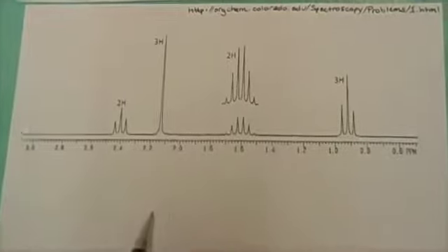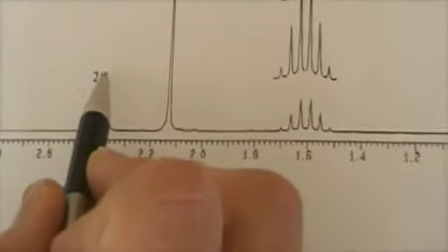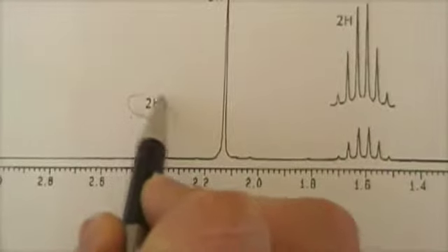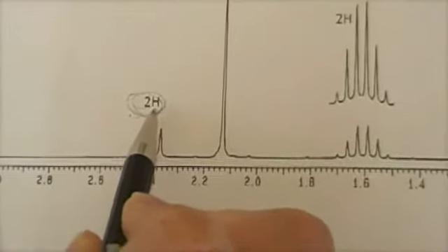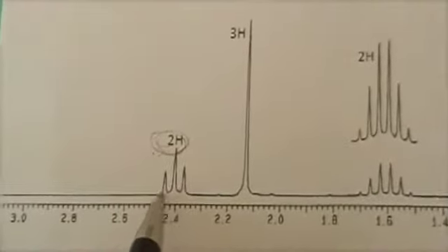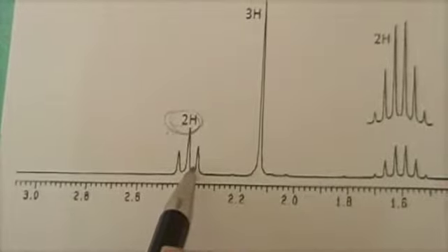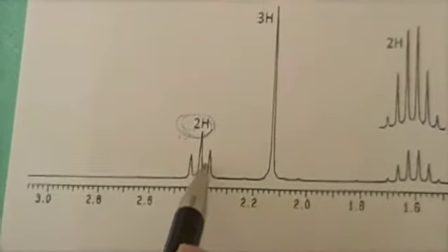So let's take a look at a simple example here of a proton NMR graph. We mentioned that integration is present on proton NMR, which shows how many protons are a part of this molecule. And here we see two H's, which means that it's two identical protons. And then our coupling shows how many neighboring protons there are plus one. So we've got two neighboring protons plus one, which shows that in this case there's a triplet.